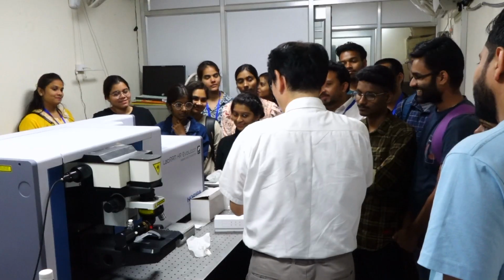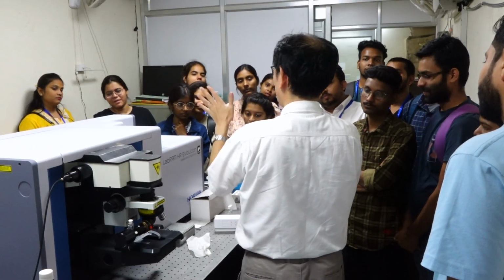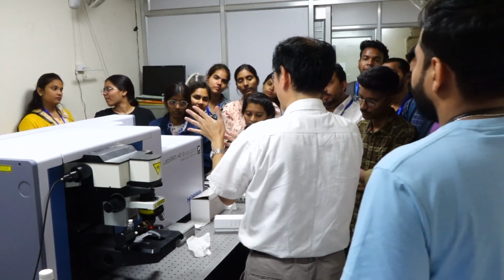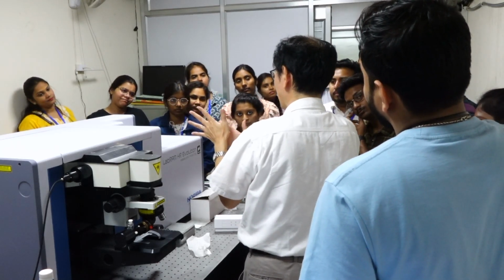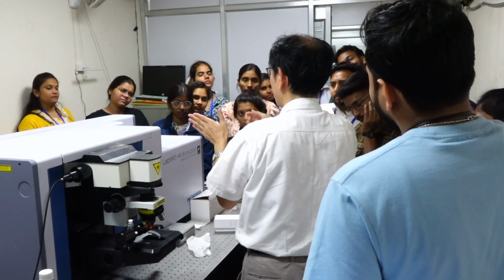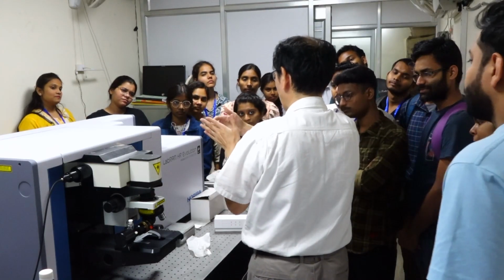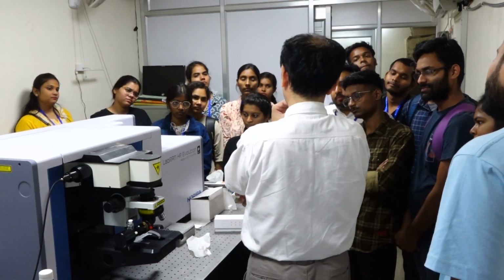They try to improve it. But for example, on the surface of the detector, some reflection occurs. So some anti-reflection coating is put on to make the throughput higher. And I'm not sure.